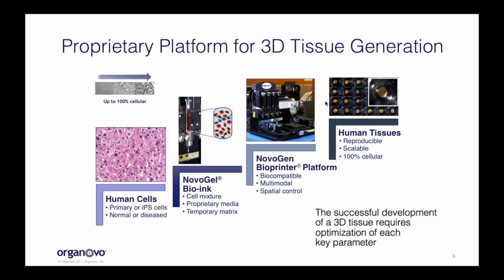And what you have then is a plate of replicate tissues. That is, all of these tissues have the same fundamental building blocks to begin with, and they can then be interrogated in the laboratory with some specific stimuli to understand the response across a plate of common starting points. Then we can evaluate how they may respond to different stimuli with some specific readouts, and that may be conditioned media, that is protein or enzyme production. We can look at the classic omics, that is, can you isolate protein, can you isolate RNA or DNA, and understand what those differential responses are like. And then importantly, we have some mass of tissue, and we can put that through a standard histopathologic or surgical pathology evaluation to understand how the different cells are behaving and what type of tissue pathology might be developing.